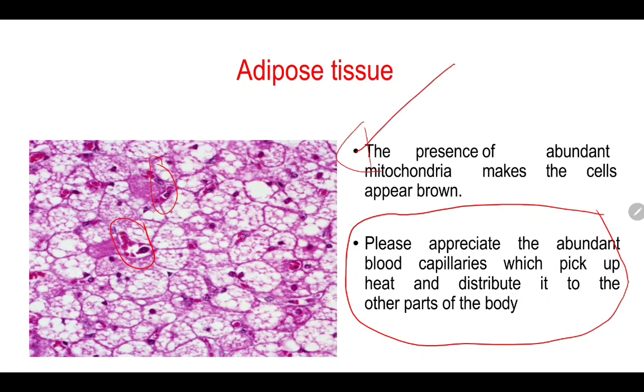So, yan, yung function niya is yung nabanggit ko kanina, no? Yan yung magdadala ng heat, yung microlipids na kung need ng body natin. I think hindi naman siguro kayo mawala regarding sa brown and white adipose tissue. Ang palatandaan ko dati dito, no? So, si white adipose tissue, and then si brown.